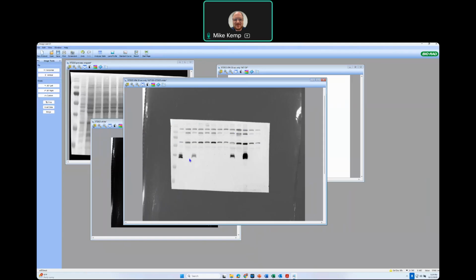Well, one is you have to know what the molecular weight of XPA is. So it's about 35 to 40 kilodaltons. This marker over here is 40 kilodaltons, and you could take a look at the membrane or the product catalog for that molecular weight marker series and know which band is which size. And so this is XPA down here. The other bands are just simply cross-reacting bands that react with some other protein in the cell.